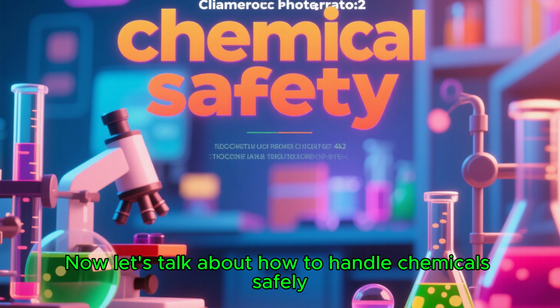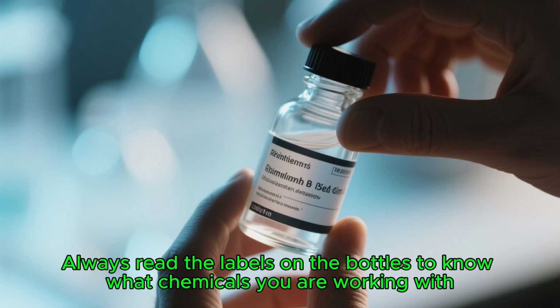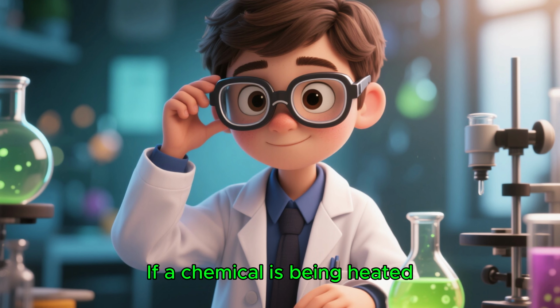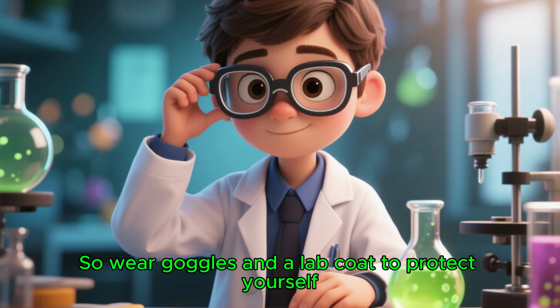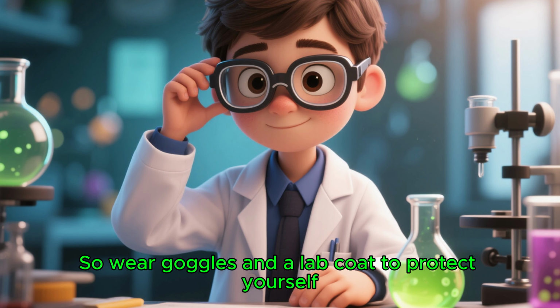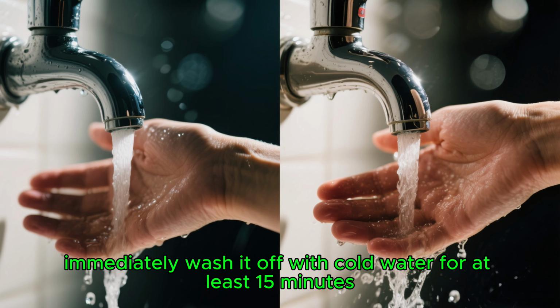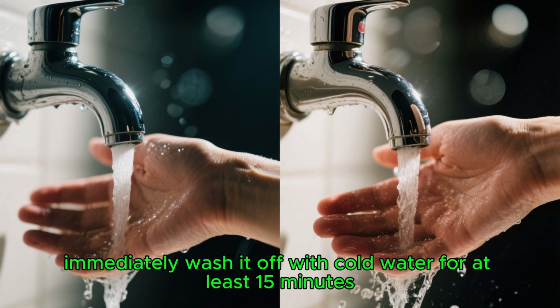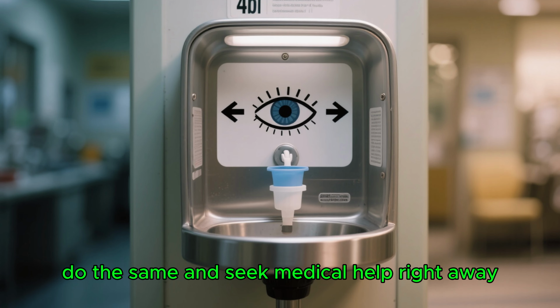Now let's talk about how to handle chemicals safely. Always read the labels on the bottles to know what chemicals you are working with. If a chemical is being heated, there is a chance it might splash out. So, wear goggles and a lab coat to protect yourself. If a chemical splashes onto your skin, immediately wash it off with cold water for at least 15 minutes. If it gets into your eyes, do the same and seek medical help right away.